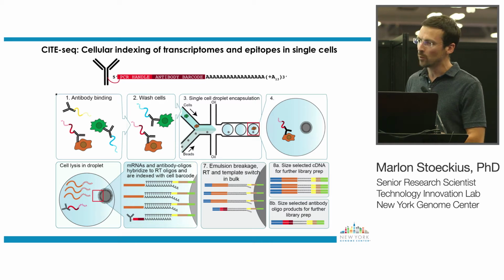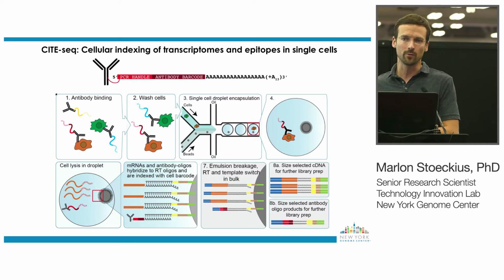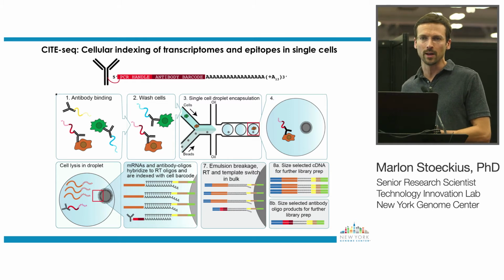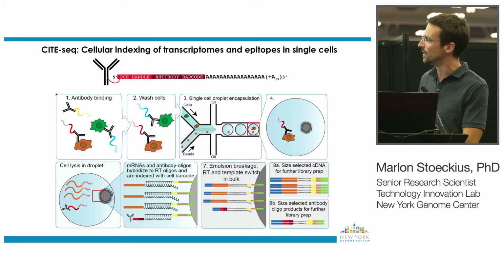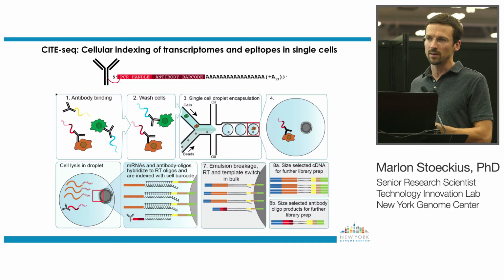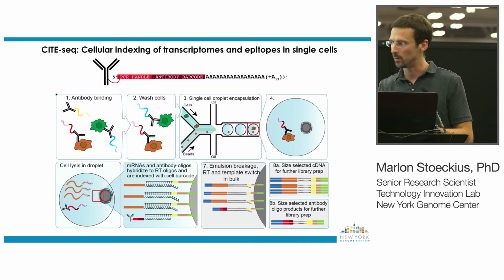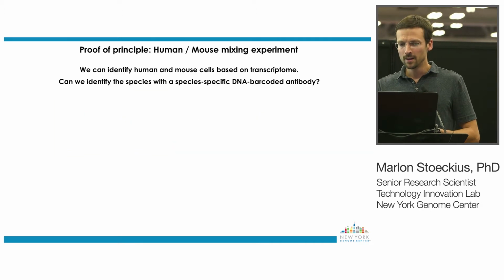And in the standard workflow, when people do single-cell RNA sequencing library prep, you basically size select the full-length cDNAs away from something that you trash. And we actually then amplify these antibody libraries out of the trash, essentially, and without any interference for the full-length cDNA library preparation. So we said, how can we test if the method is actually working?